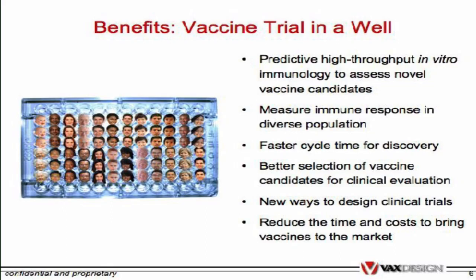And of course, we can look at antibody forensics by a variety of means, and I'll touch on a bit of those as well. And then I'll expose you to how we've automated our system to make it a high-throughput system, which can be used to look at several hundred compounds at a time. Of course, that becomes very important for any pharmaceutical company that is looking to down-select the number of molecules that they want to get into clinical trials. Certainly, if you're going to fail in any clinical trial, it's best to fail early because then it's cheaper.